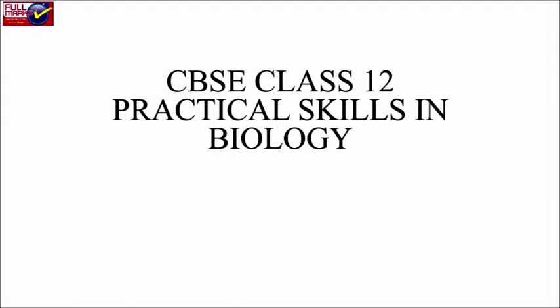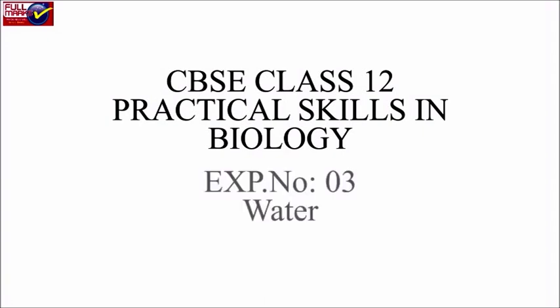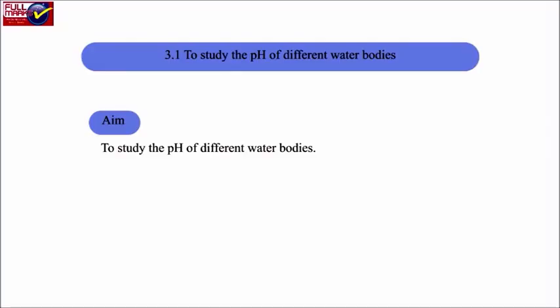CBSE Class 12 Practical Skills in Biology. Experiment number 3: Water. 3.1 To study the pH of different water bodies.